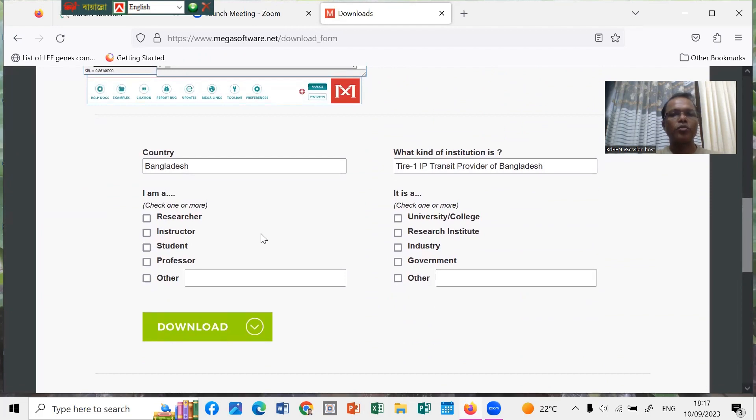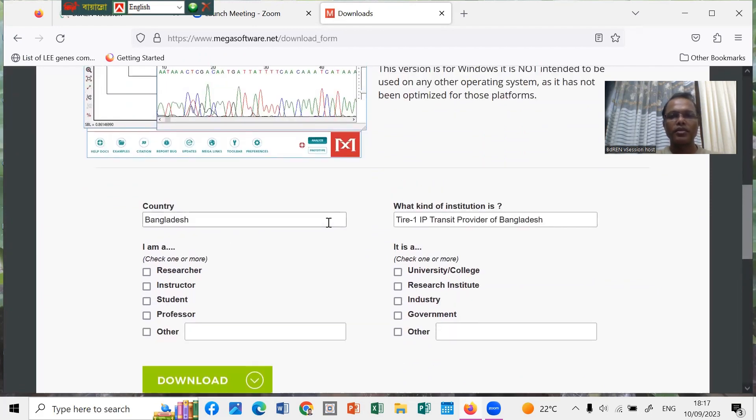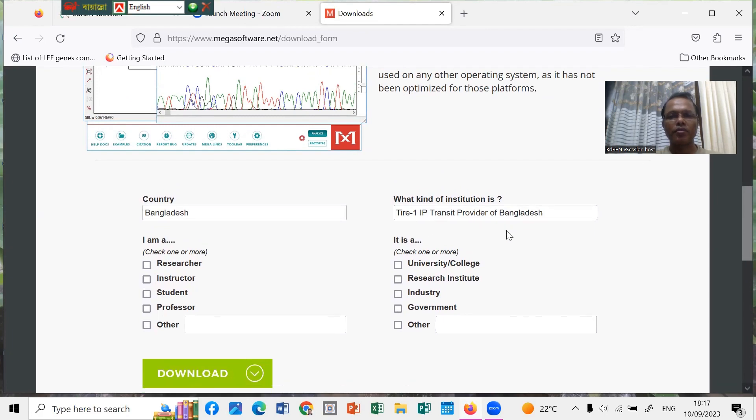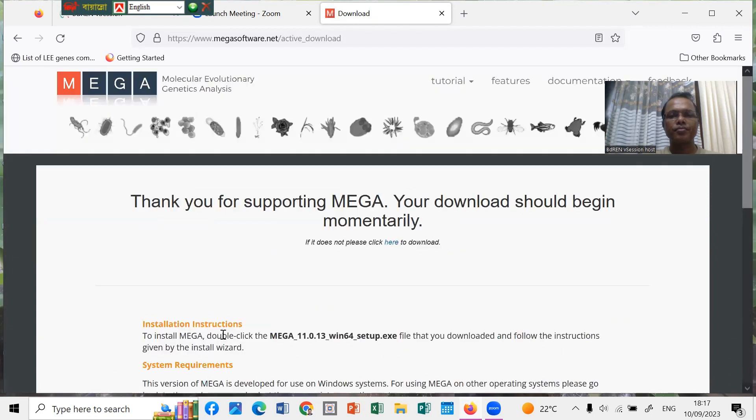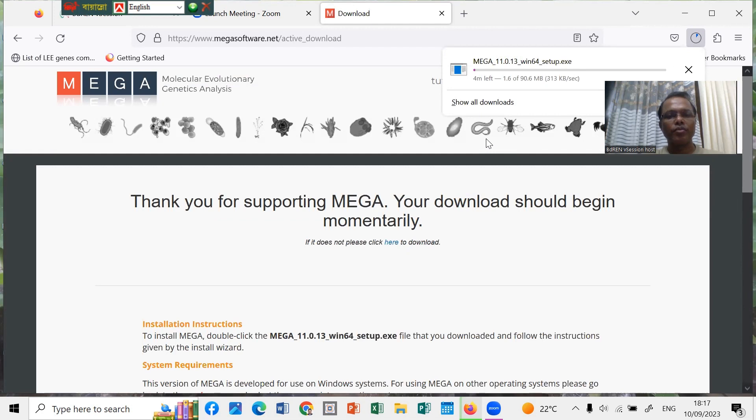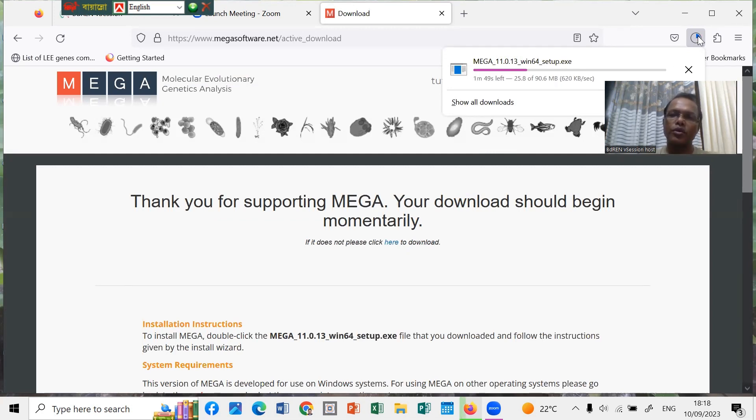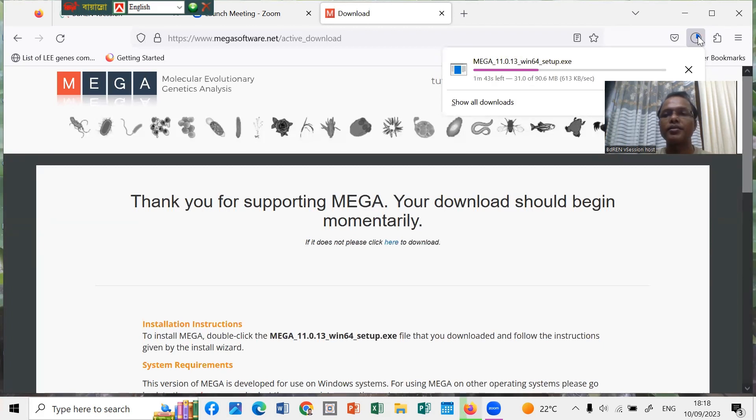You have to fill up the form. This is the country Bangladesh, the country of the institution is IT transit provider Bangladesh. Just wait a few minutes, it will be downloaded. We have to wait for downloading the whole file, it is about 90 megabytes, so it takes a little bit of time. Please be patient to download this MEGA software.